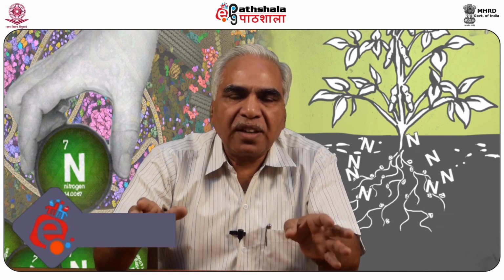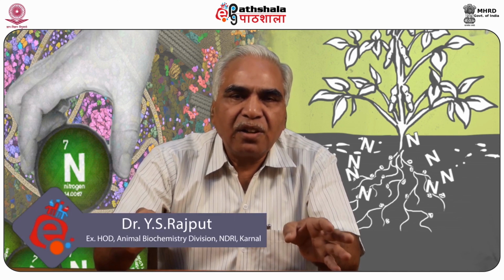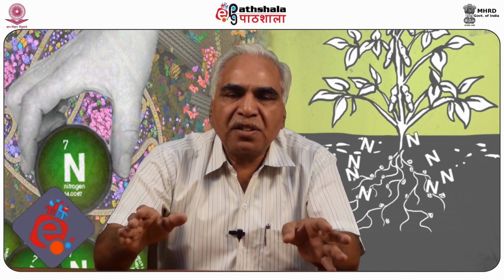The technique can be performed by a technical person. Availability of the reagents and enzymes from several commercial houses has helped in its wide use. We cannot think of a molecular biology research laboratory not using the polymerase chain reaction in a routine way.